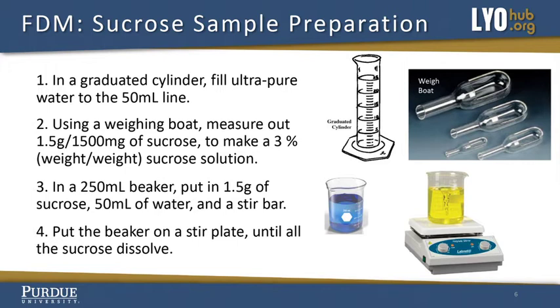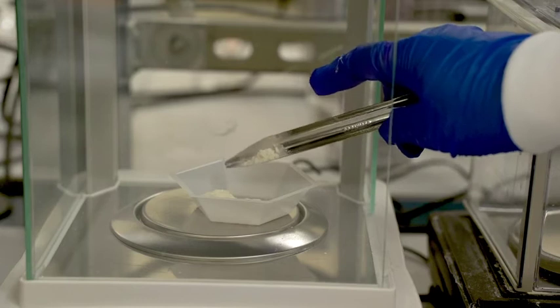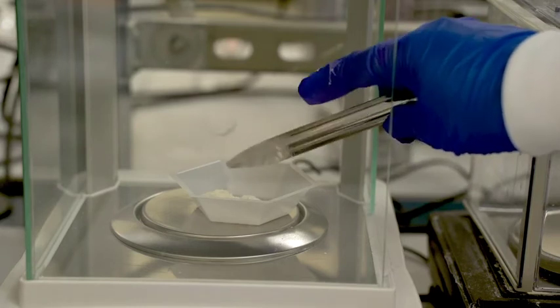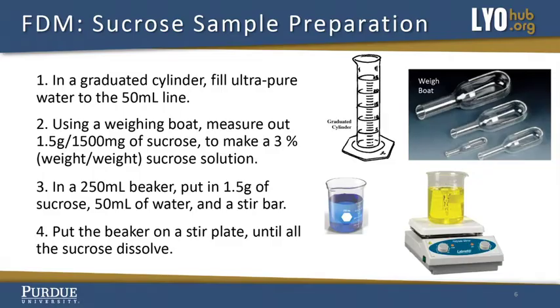Using a weighing boat, measure out 1.5 grams of sucrose to make a 3% weight sucrose solution.